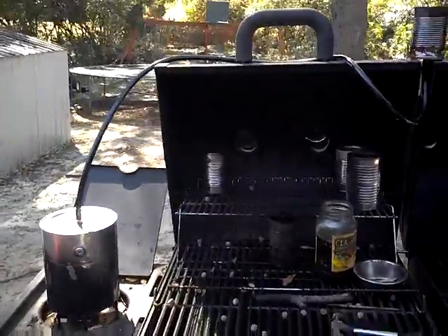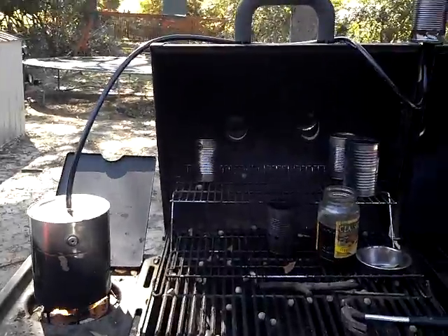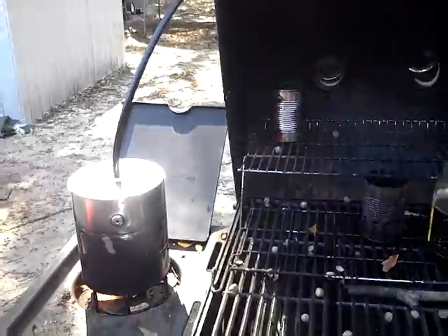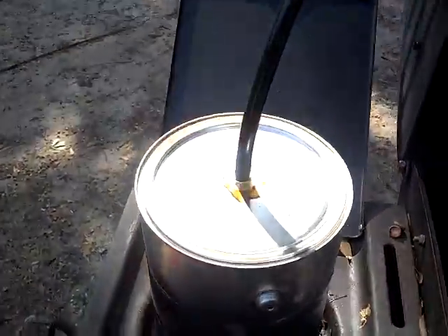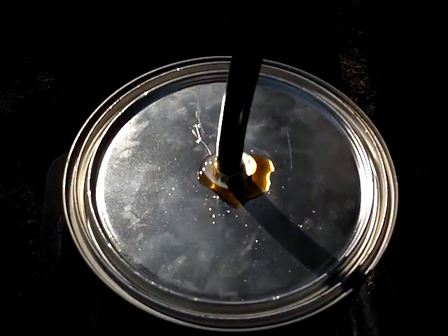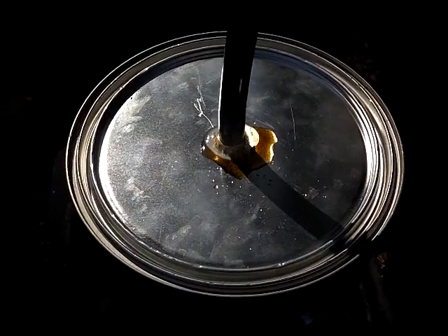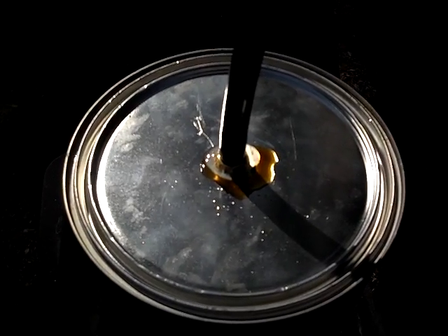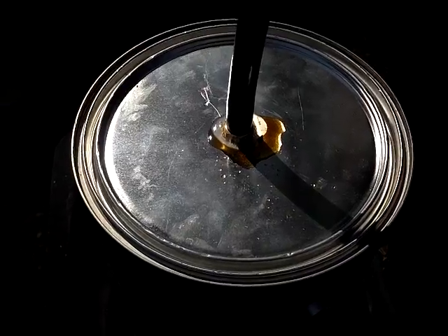All right ladies and gentlemen, this is Benjamin again. I'm going to show you how NOT to do methanol removal from glycerin — your biodiesel glycerin. What you see here is definitely very primitive. First things first, see on top of there — that goop. The brown goop is the glycerin, and the clear goop around there — you probably guessed it — is hot glue. I used hot glue thinking it's not going to get that hot.